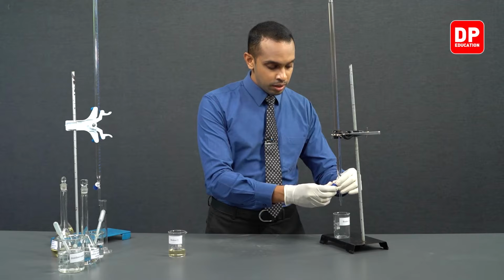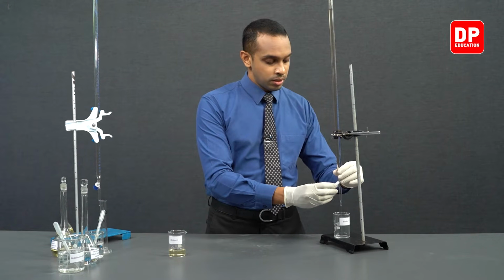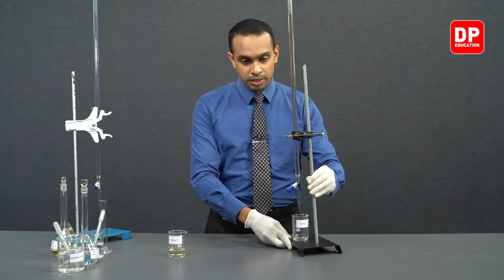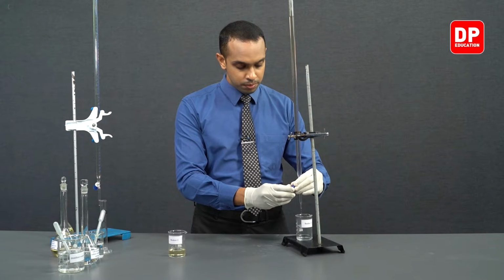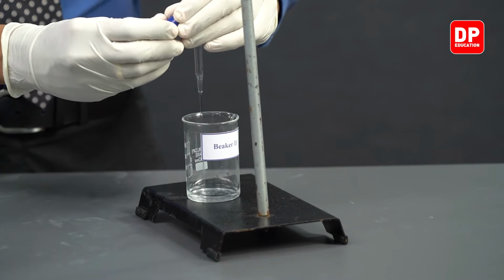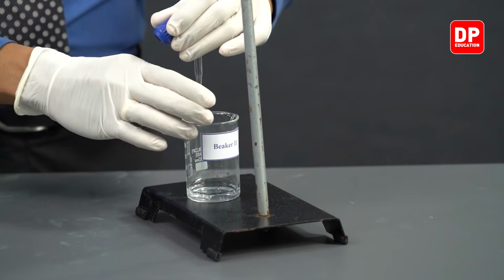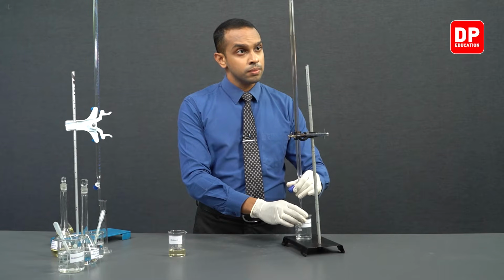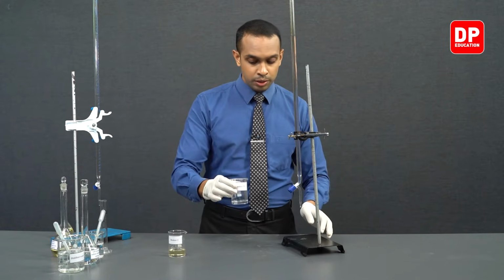So let's proceed to take 10 cubic centimeters of potassium iodide into beaker 2. We have measured exactly 10 cubic centimeters of potassium iodide into beaker 2 now.